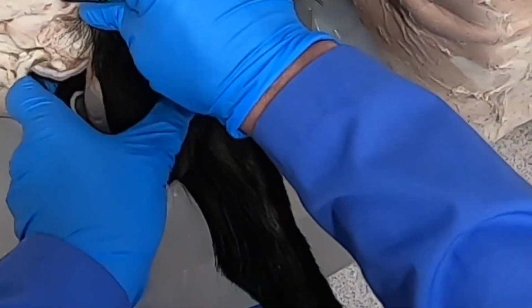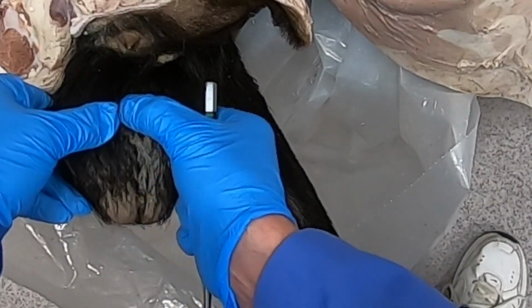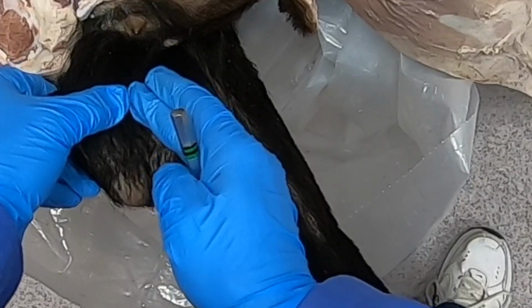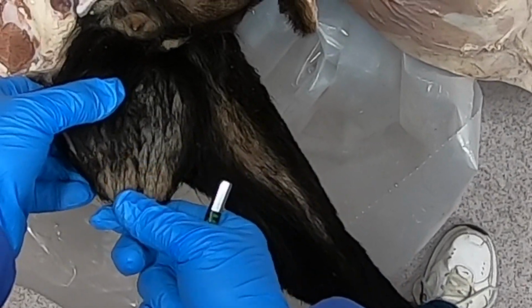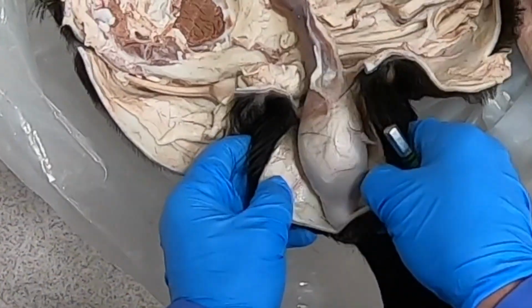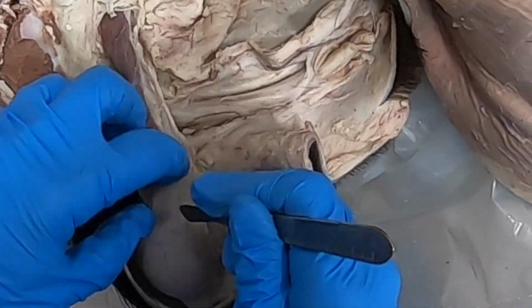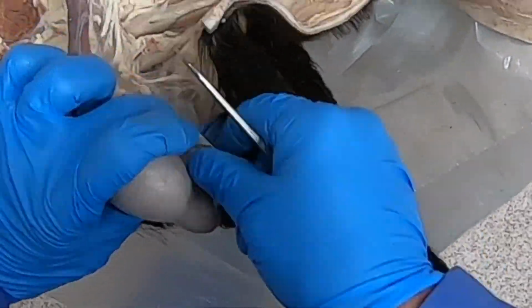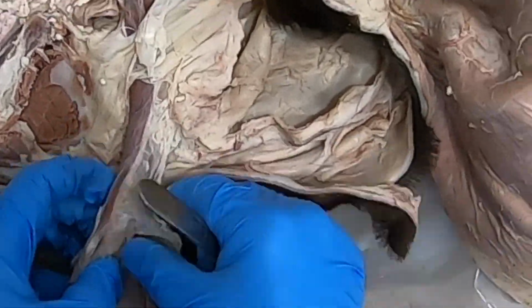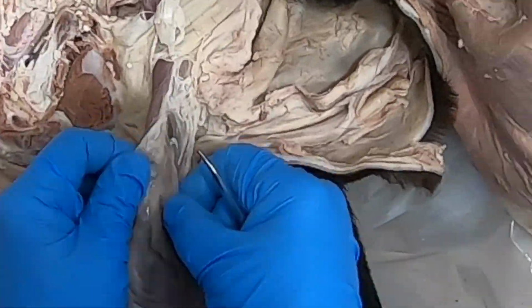Okay, so now what I want to do is I want to cut open. Oh, before I do that, I want to show you. So you can see here in the scrotum there's actually a division here, a visible division between each side. You can actually see where the tail of the epididymis sits, because as I showed you earlier, the tail of the epididymis is quite large. And so now I want to open up this vaginal tunic here so that we can expose the testis, the epididymis, and so forth.